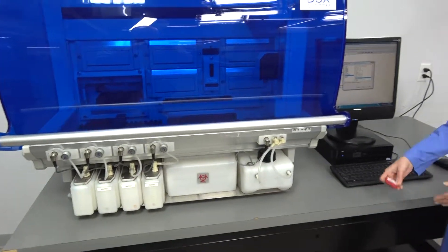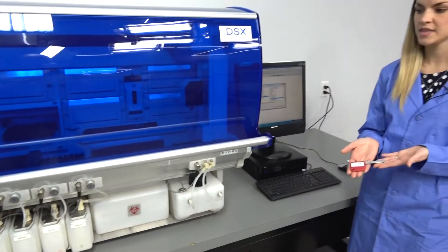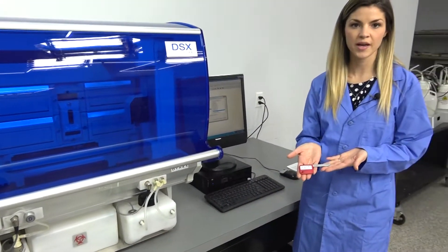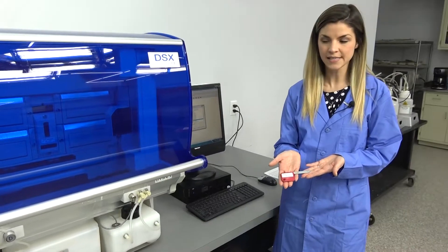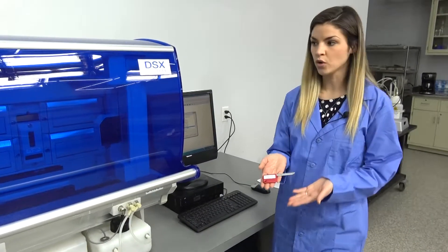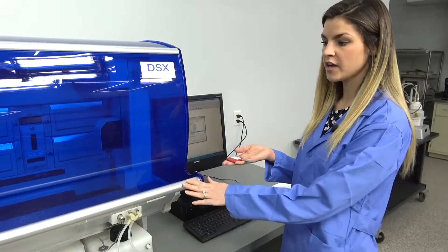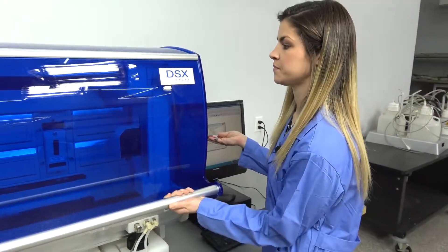And this purchase actually comes with the door lock bypass key, which will hold the cover up while it's in use.